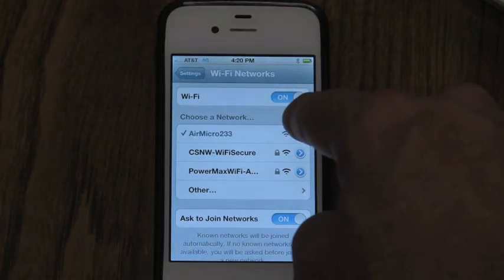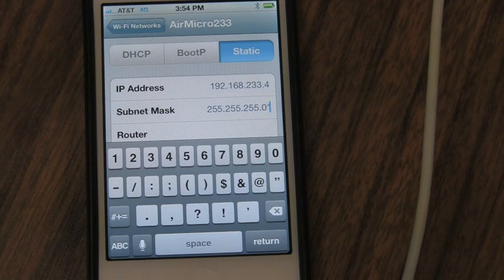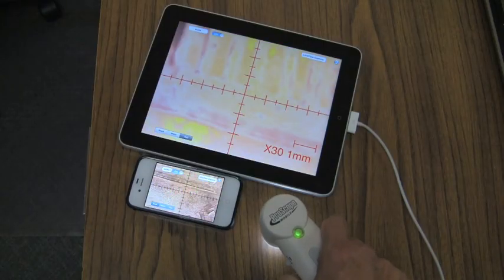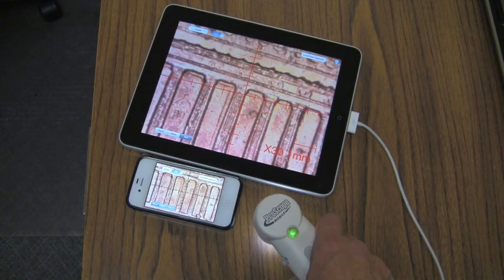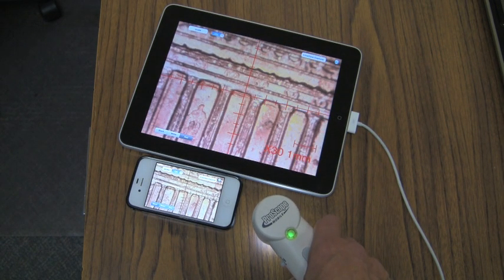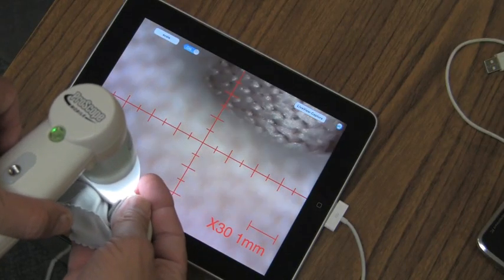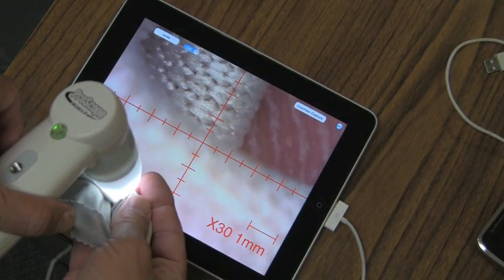I'll do the same process with my iPhone, and I'll change the last digit to a 4. Once you set up an Apple iOS device on your particular ProScope Mobile network, all you have to do is turn the power on your ProScope Mobile, make sure your Wi-Fi is on, and select the AirMicro network in your device.